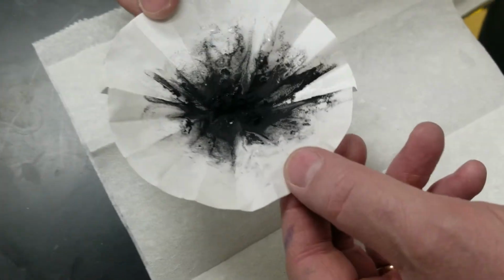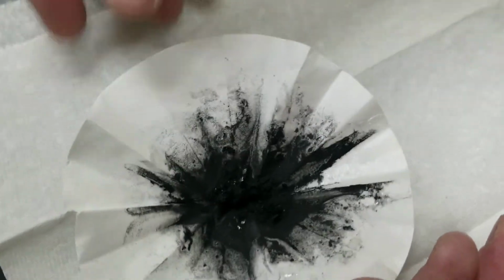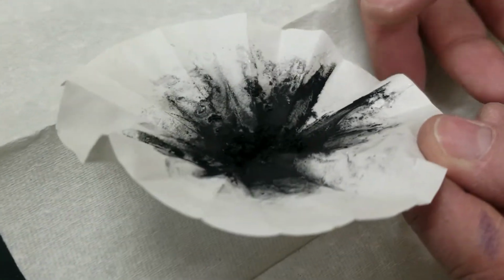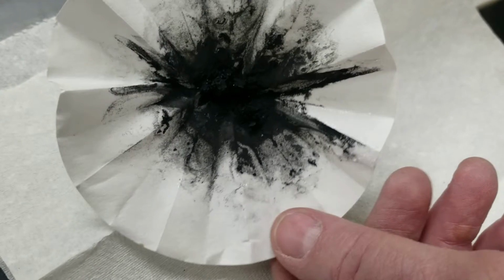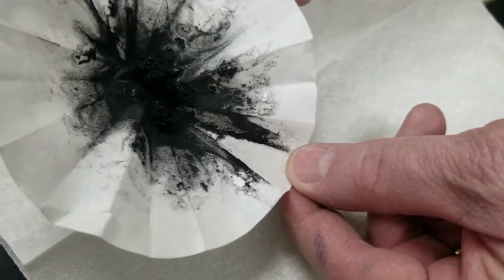We've dried our piece of filter paper and we're looking to see how many sparkles are shining. There's one big sparkle right here. I don't know if you guys can catch it. Yep, there's a little bit of sparkling there. So that is actually some of our product that got away. We didn't put enough hot water through the filter paper.